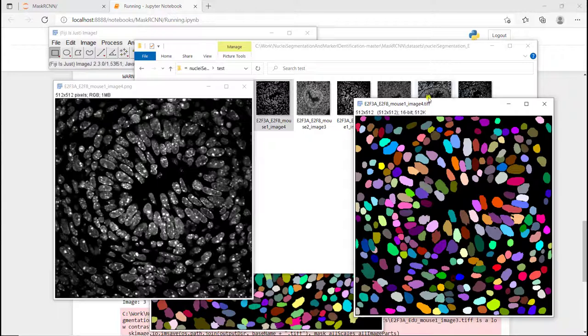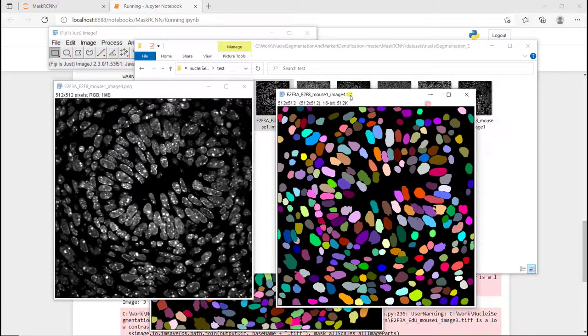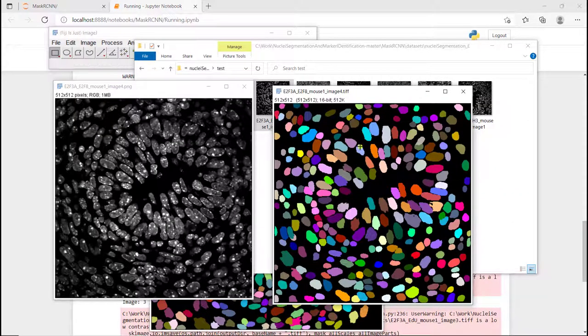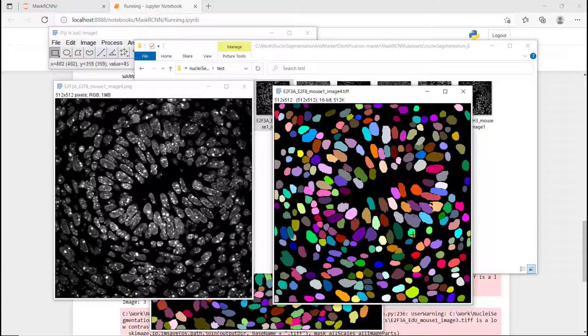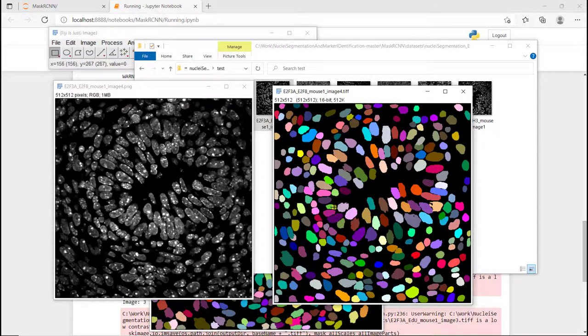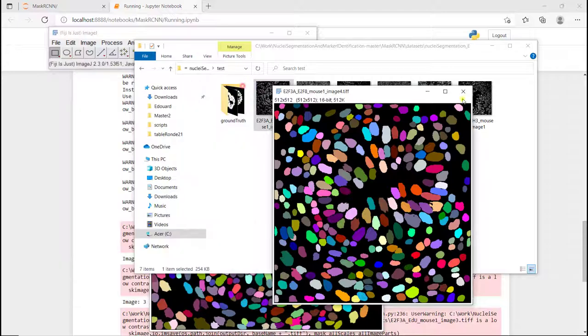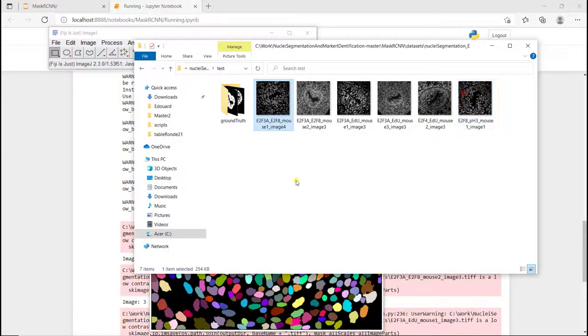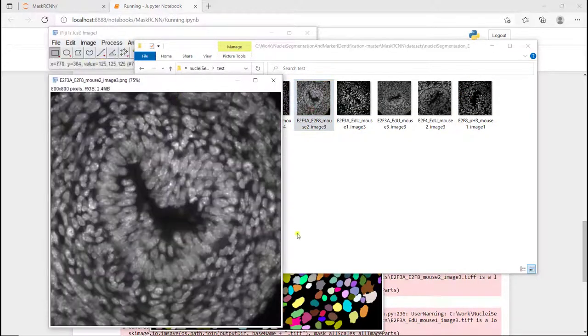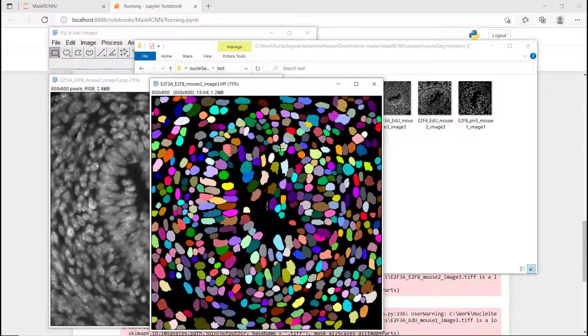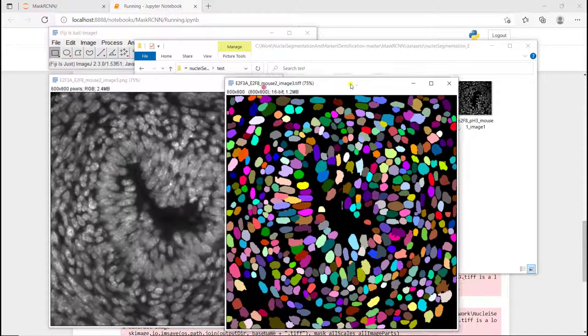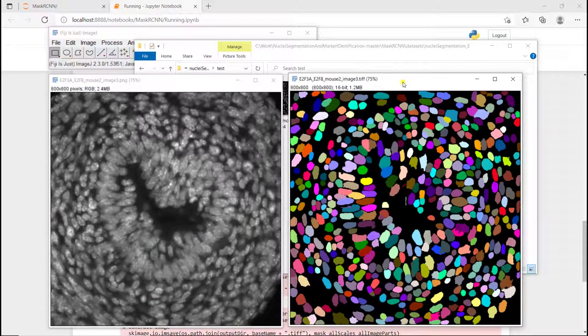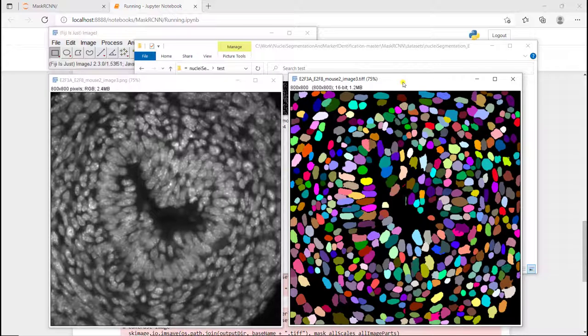Otherwise, it looks pretty decent, I would say. And finally, if we look at this whitefield, this is what we get. And it's not great yet. We would need to do more augmentations there.